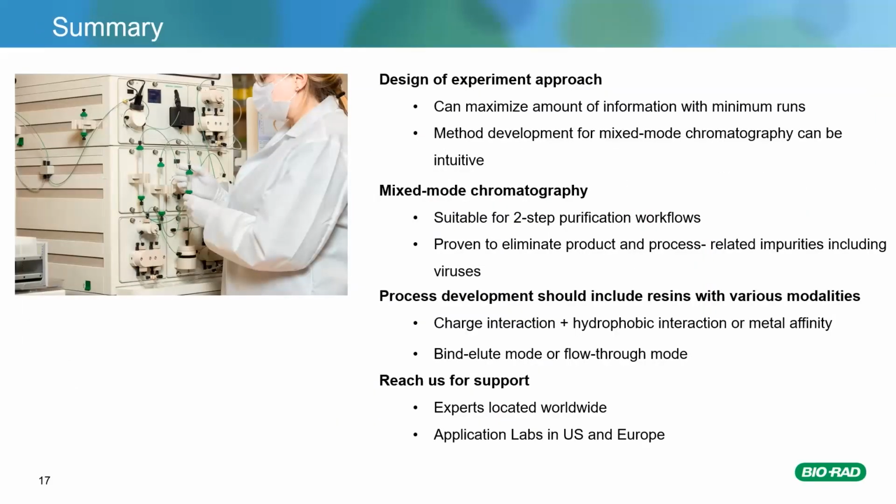In summary, design of experiment approach is a very useful tool to improve efficiency of the process development. It can help you quicker and more deeply understand the process, which can particularly be useful when working with mixed mode resins. We can see in the field that two-step purification workflows with mixed mode resins become more and more popular.